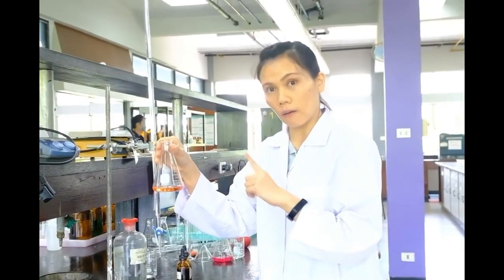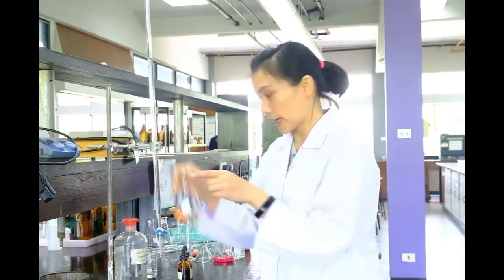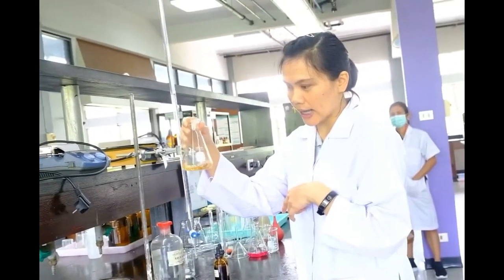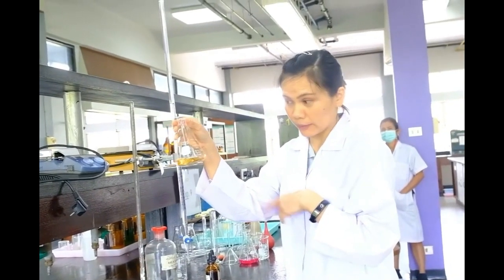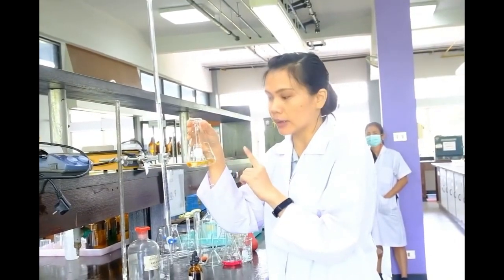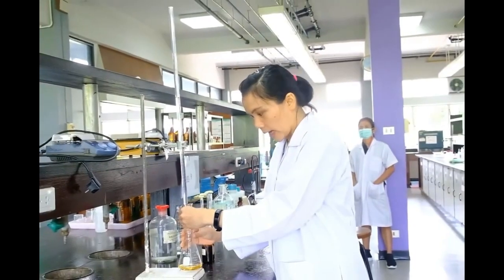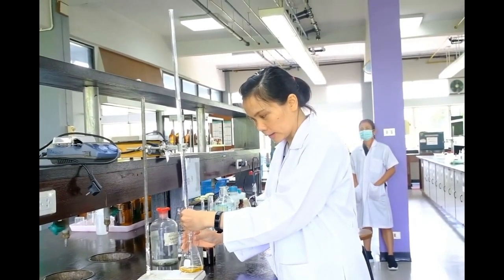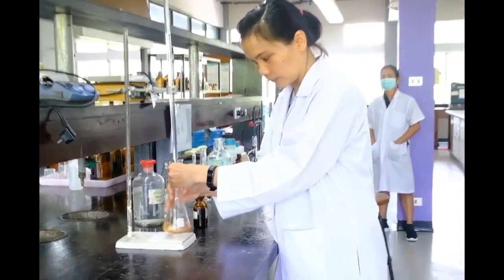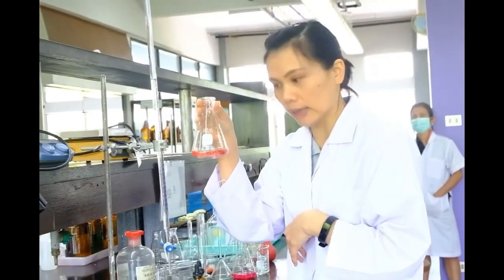Then continue titrating until you reach the second endpoint, which is the original orange color. After that, you will regain the orange solution. This is the second endpoint. Students should record the volume at both endpoints. If students continue titrating, they will exceed the endpoint and will obtain a red solution. This indicates that the solution has exceeded the endpoint.